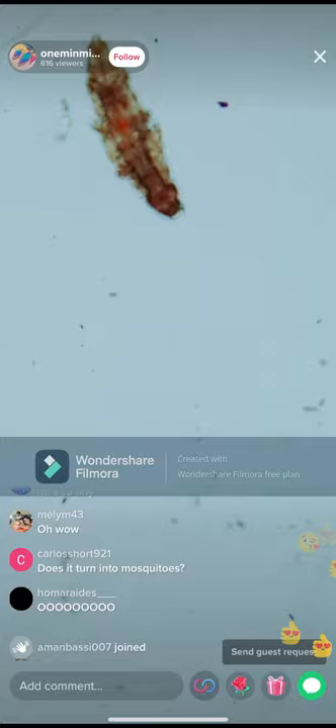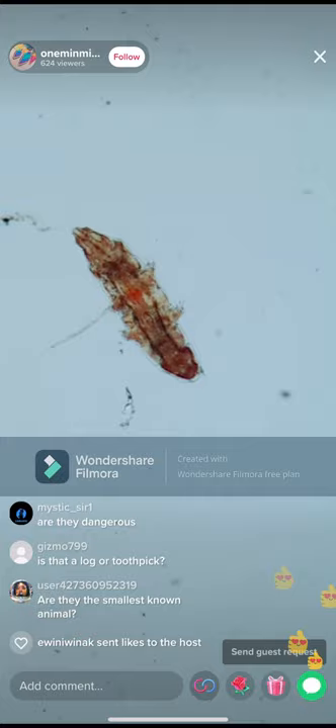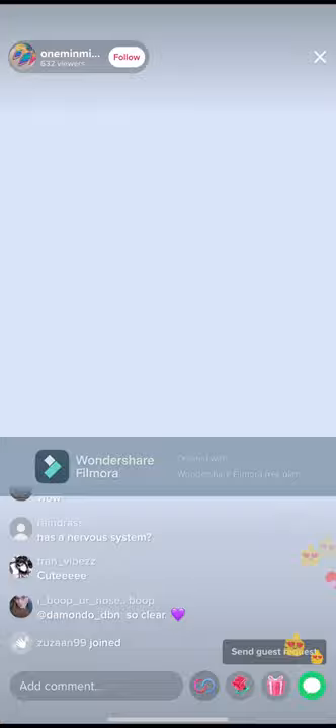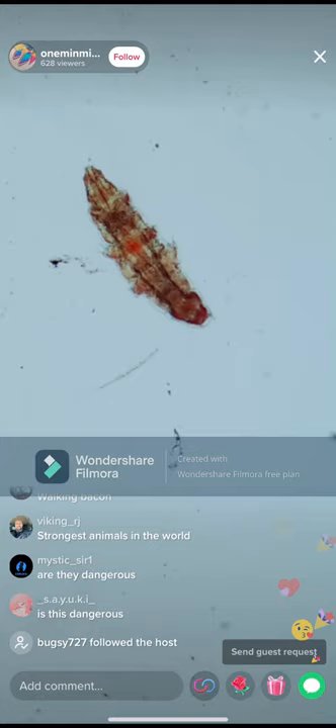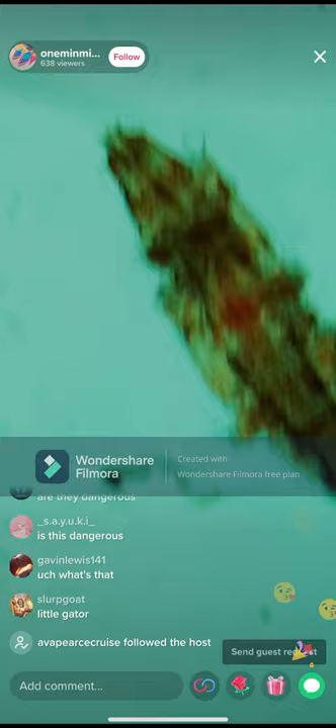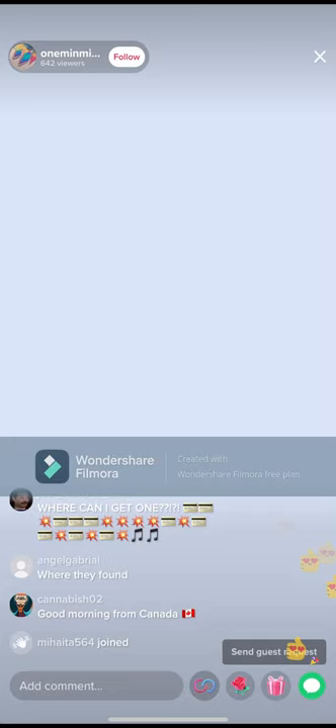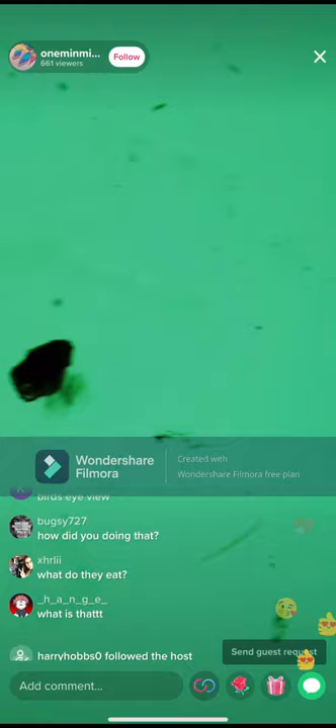You can see it's incredibly tiny — even less than a millimeter. A big one would be half a millimeter. These animals — and that's what they are — are microscopic animals. This is at a hundred times magnification; let me twist the filter. I've got a really cool thing to show you in this sample. Our main tardigrade is there — this is a water bear.